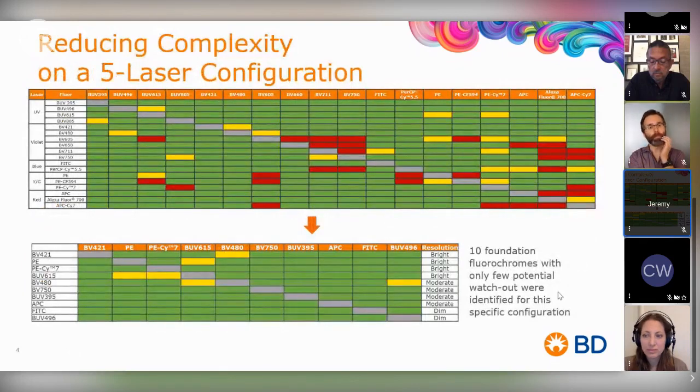One of the central themes of the webinar was the use of a spread matrix as a reference to identify fluorochrome combinations that might be challenging in terms of spillover and spread. We talked about the caveats of using this spread matrix and how the amount of spread would be eventually variable depending on the biology or the instrument configuration.